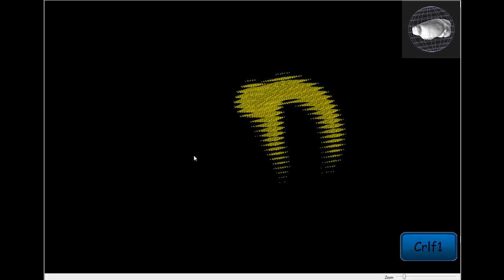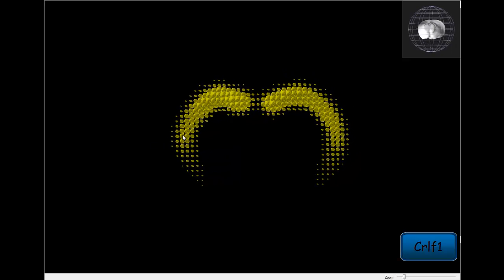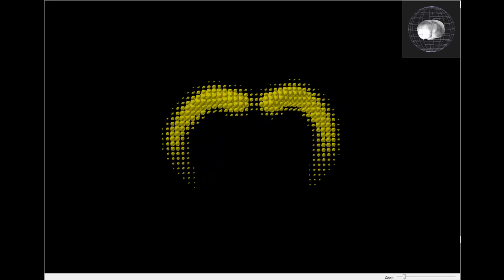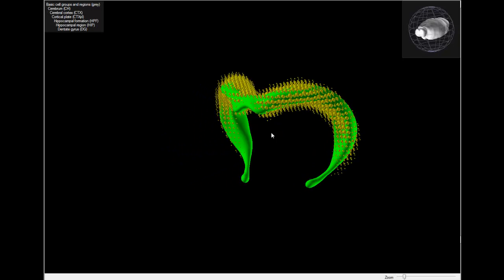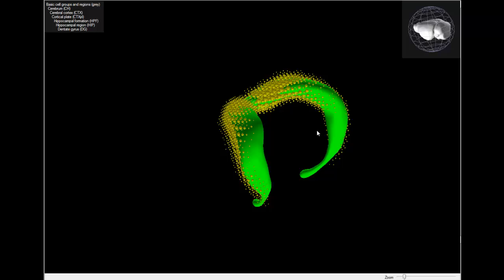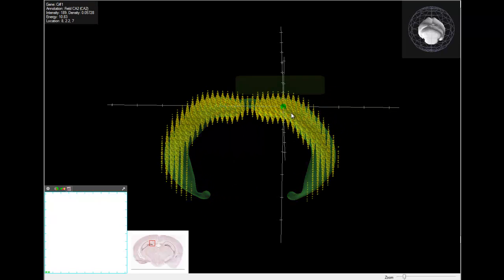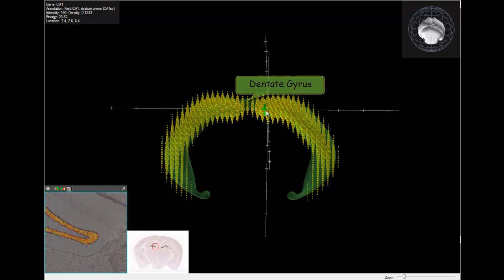In Brain Explorer, what we now see is the gene expression for the gene we chose, CRLF1, in three dimensions. We can add the reference atlas dentate gyrus by clicking the A column next to the dentate gyrus in the ontology list of the Brain Explorer. We can also make the structure transparent by clicking Transparent from the Atlas drop-down menu and see the original data by clicking on one of the voxels.